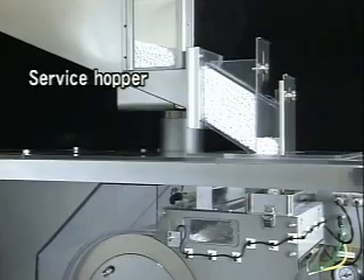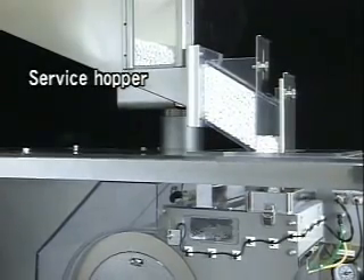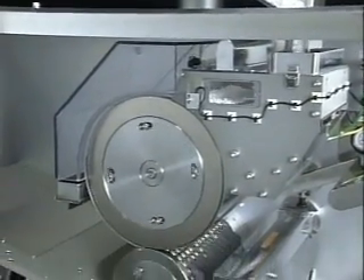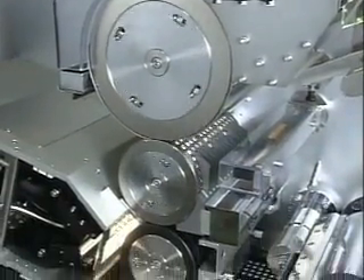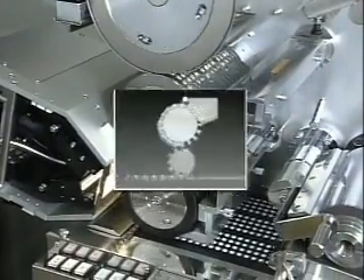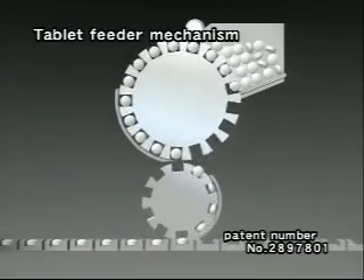Tablets that enter the hopper are precisely fed to the supply drum, and the entry of two tablets at once or the omission of tablets is prevented by a guide adjusted to the thickness of the tablet and by mechanical vibration. We have succeeded in supplying non-round tablets almost perfectly by making use of differences in tablet thickness and length over the short tablet path.